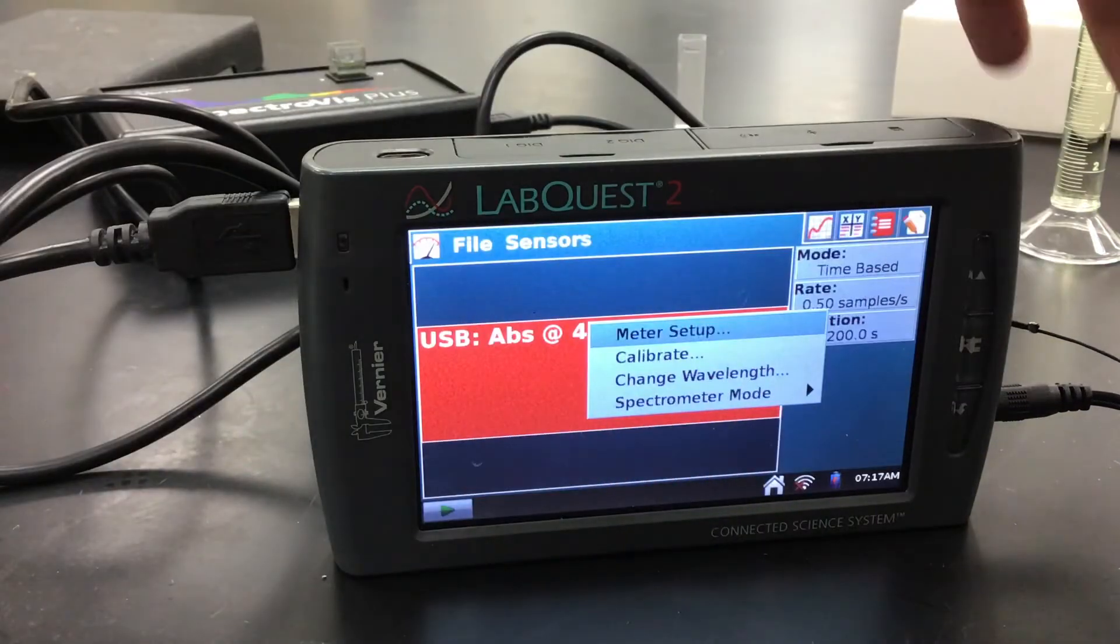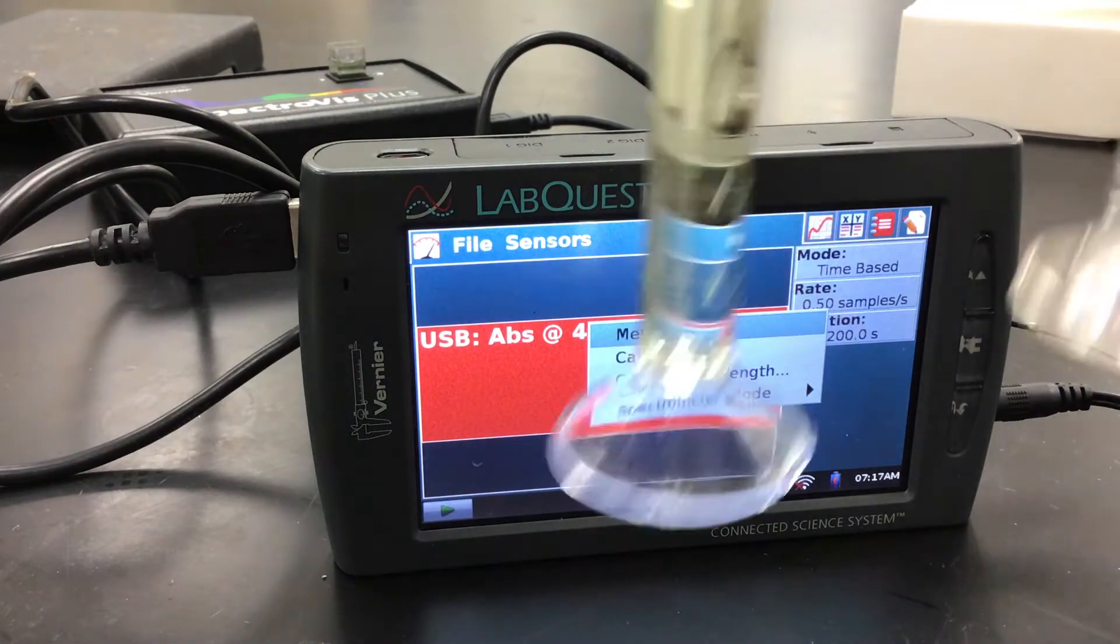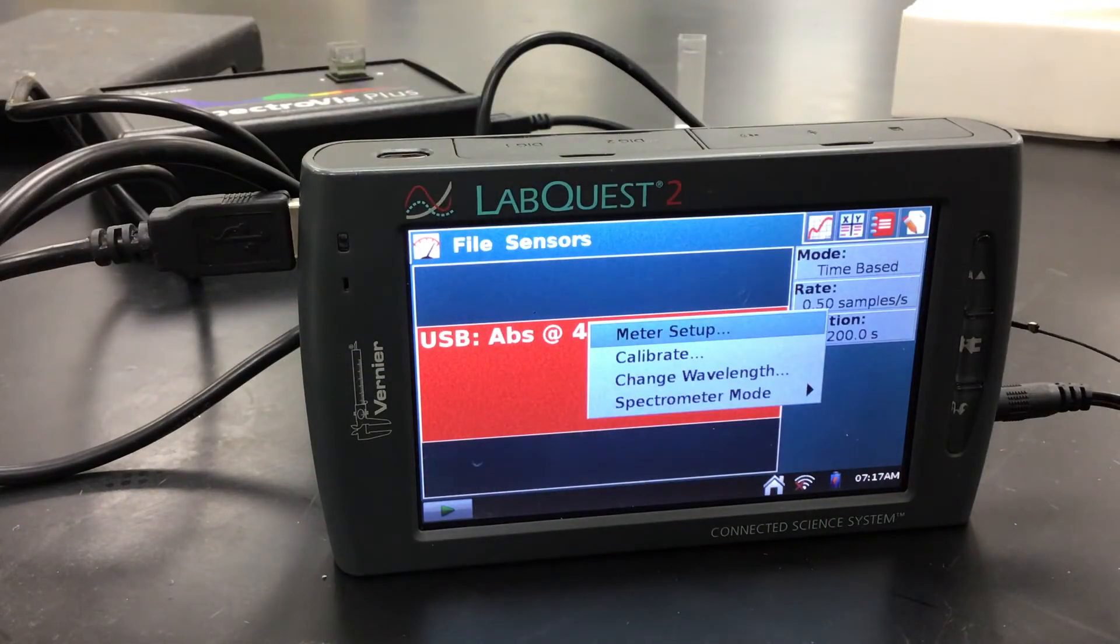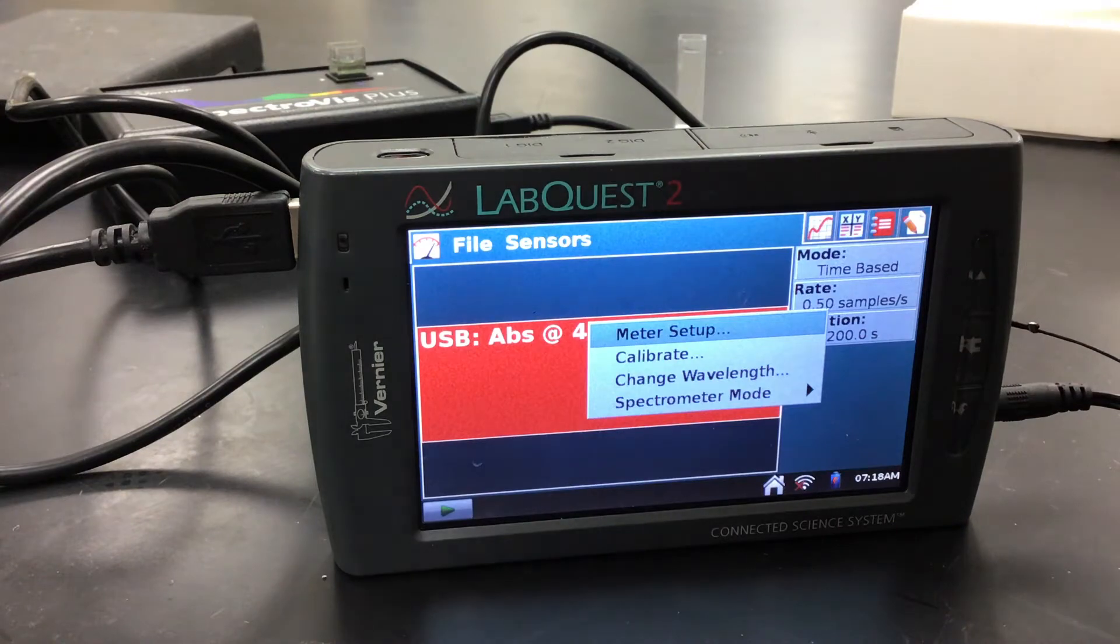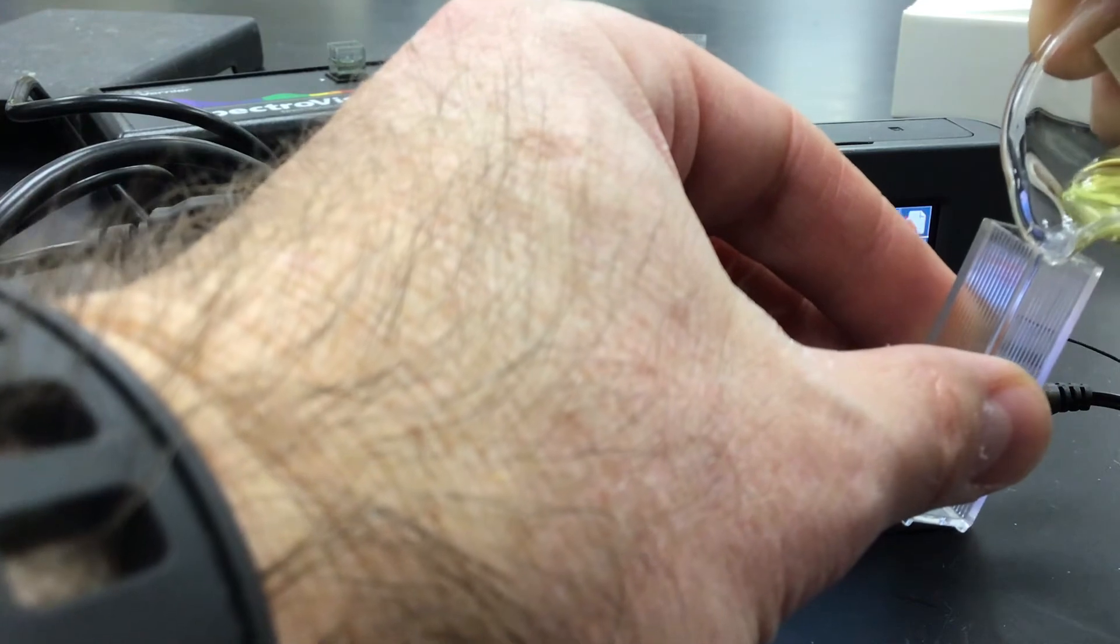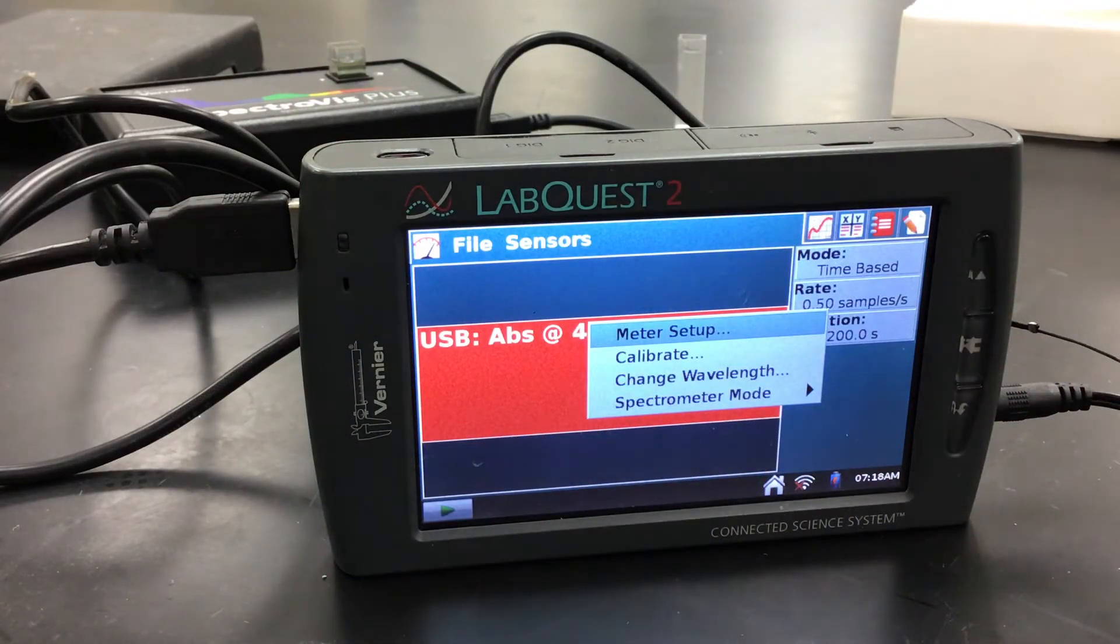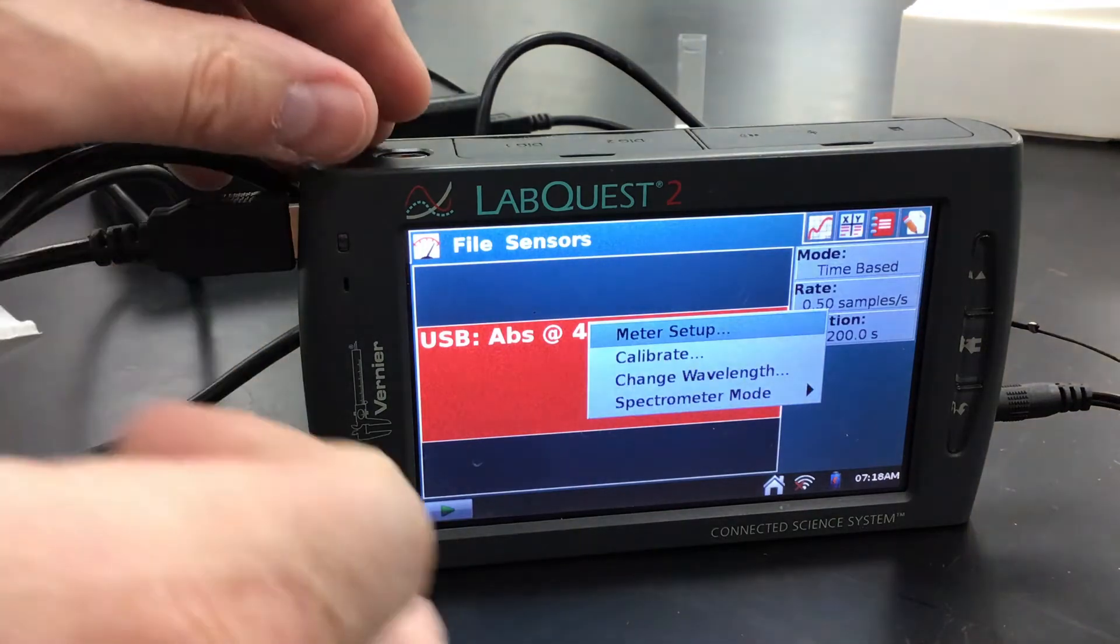All right. So I'm going to do this kind of off screen here. Going to mix my first set of solutions. I've got 10 milliliters of each solution and no water. So I'm going to mix these together and then we're going to put them in the cuvette and then we're going to hit start. I've dumped them in there. It should be enough to kind of mix it. All right. And make sure my cuvette is clean. So without kind of rushing, I'm going to go ahead and hit start.